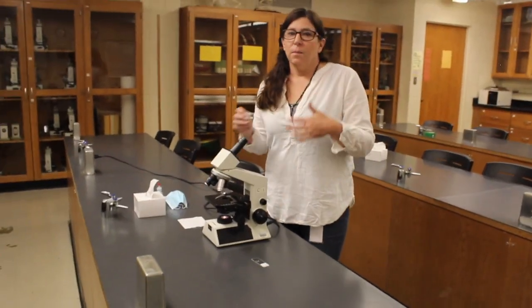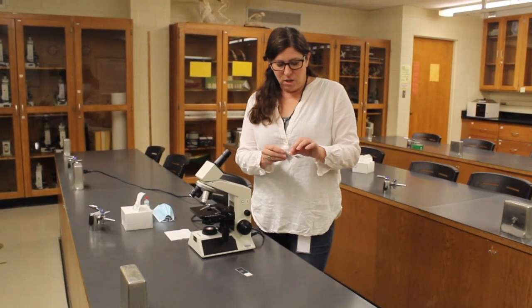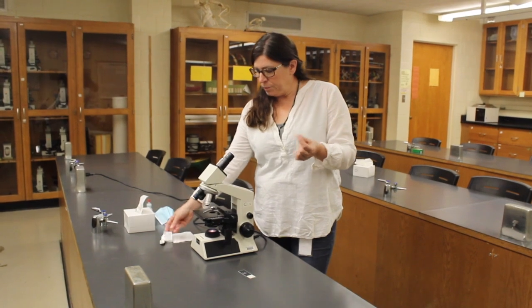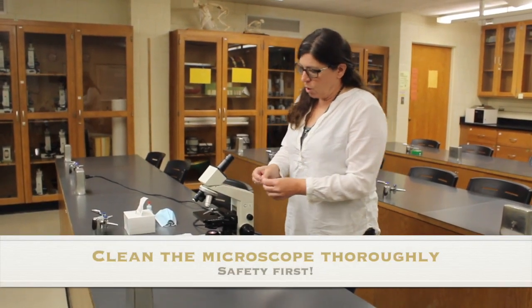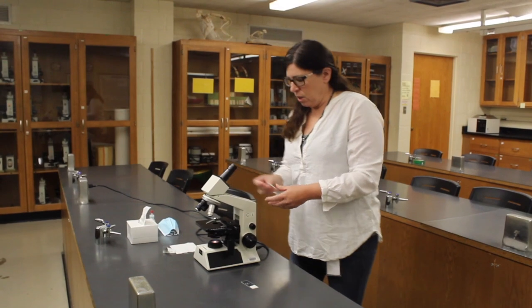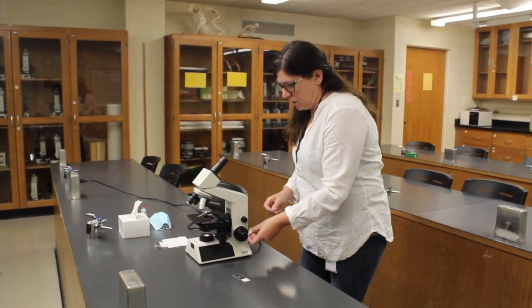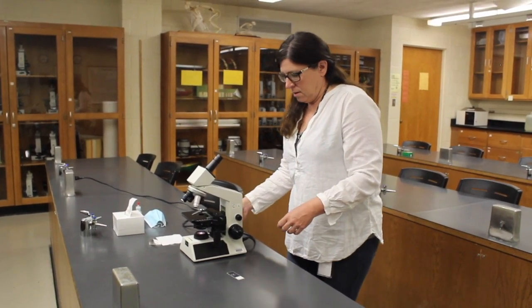Next, we're going to clean our microscope. You know, we don't want to have anything contagious being passed along. So another alcohol prep wipe for you. And any place that you touched needs to be cleaned. So I touched the lenses. I touched around here a little bit. I definitely was on the coarse and fine focus on both sides. And you're done.